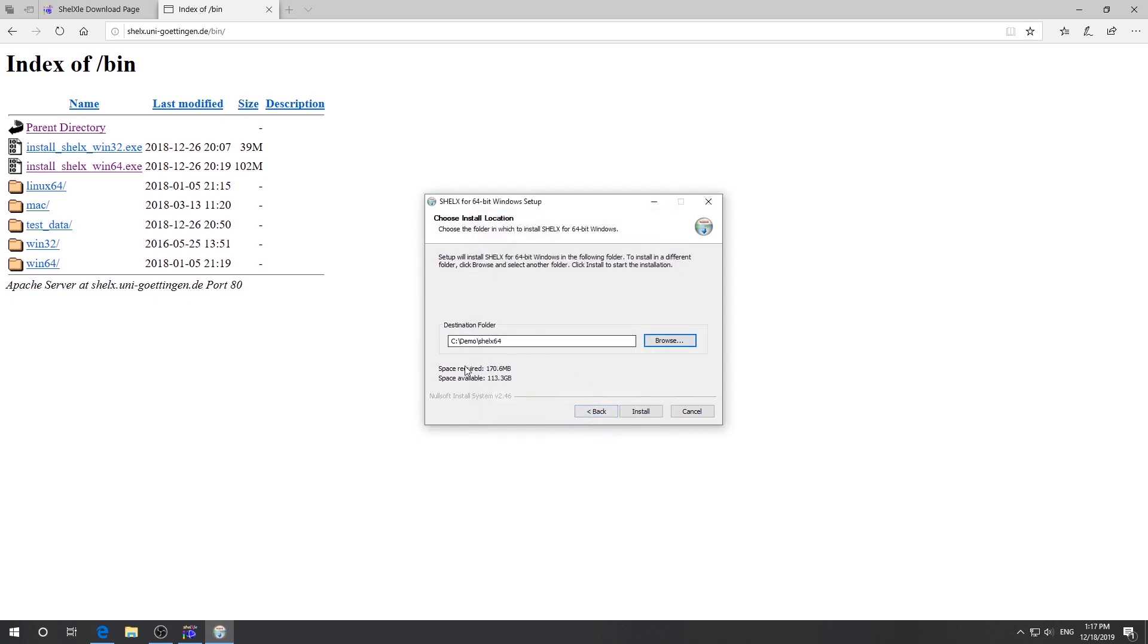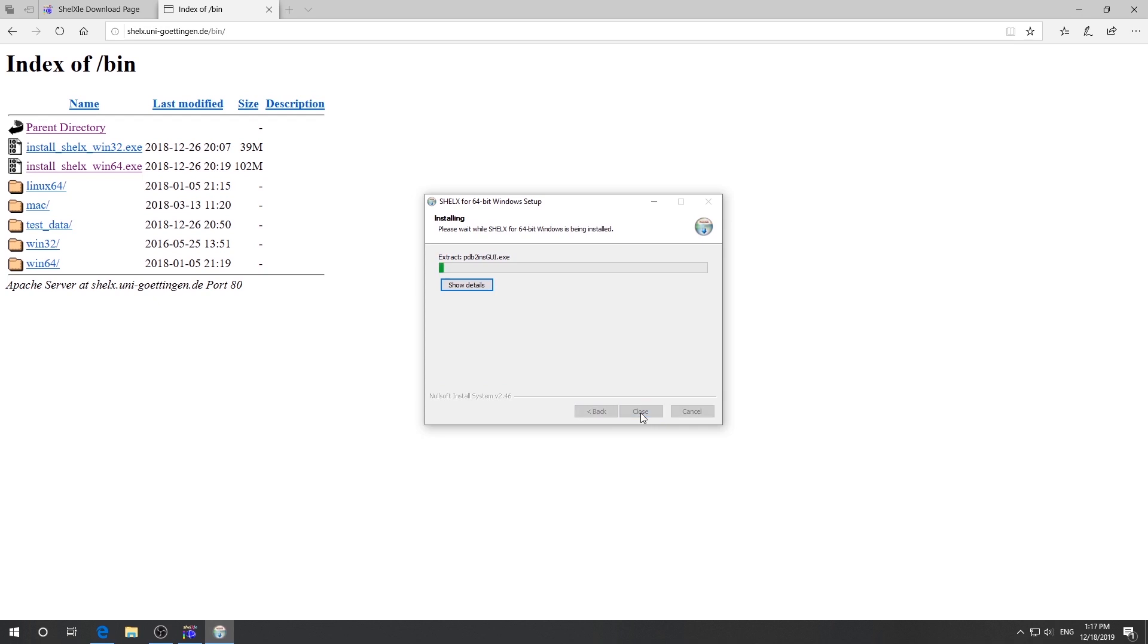Then click OK. Make sure to remember this folder as we need to come back to this one later. Then click install. Then click close.